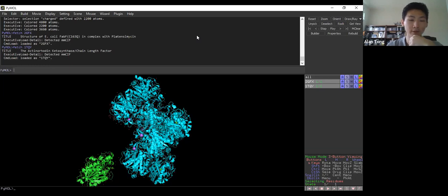So you can use this to create vaccines. I wouldn't say create vaccines, but you can use it to visualize the proteins, right? So the molecules that the vaccine induces, an antibody that your body makes, you can crystallize the antibody and maybe visualize how the antibody binds to the antigen, right? And you can then start to engineer the antibody, or evolve that antibody to be better at what it does. So let's align these, right?